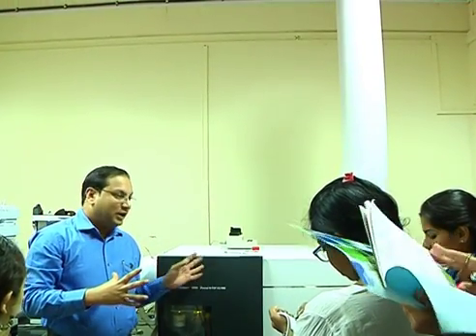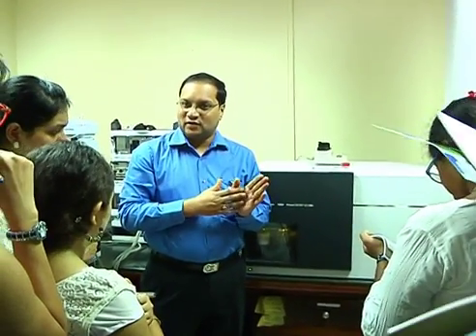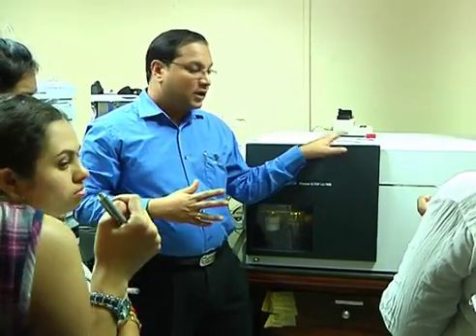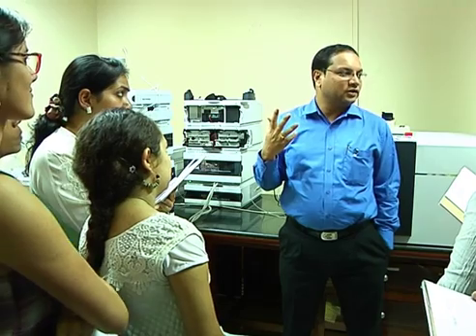Okay, meaning in tandem with respect to doing an MSMS. So there are two different analyzers, quadrupole and time of flight. And that is coupled to an HPLC. That's why we call it LC-MS, or HPLC-MS. So you know there are versions of proteins in the samples.